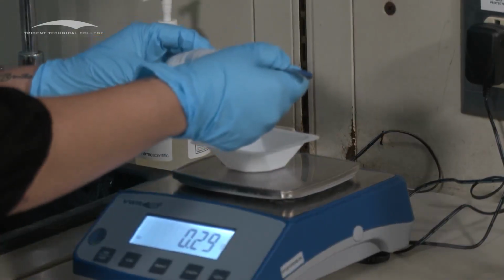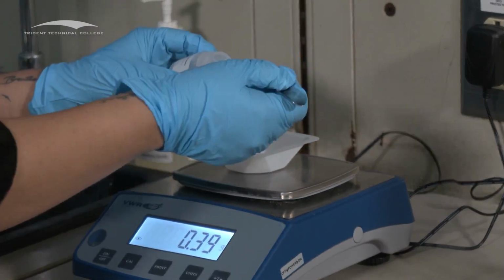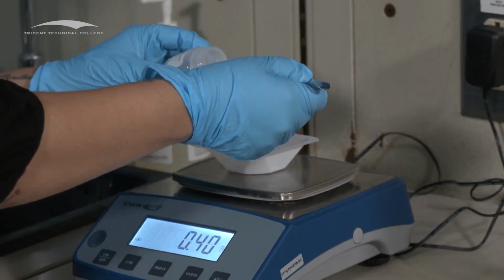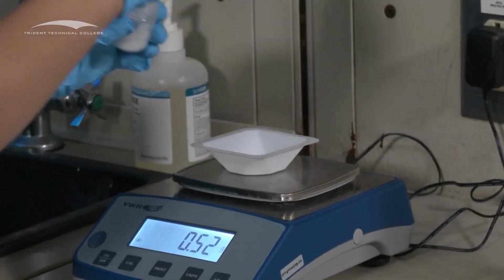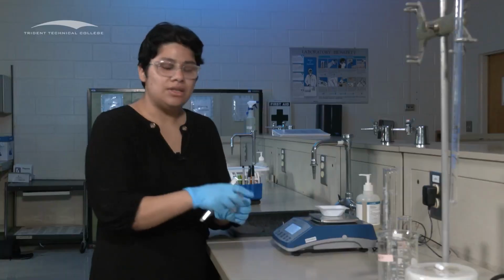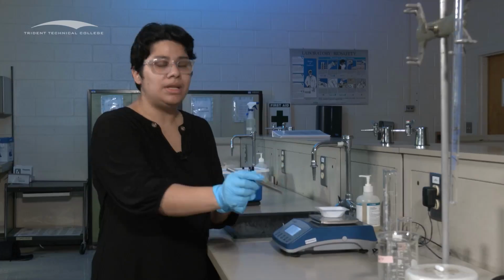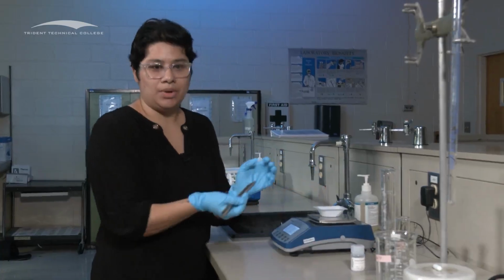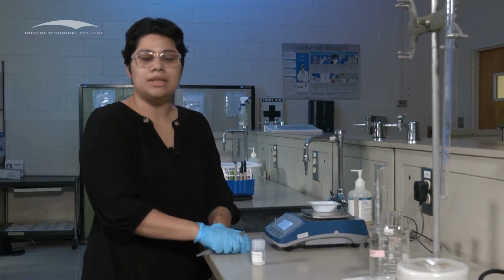So we're gonna go ahead and get our, I'm gonna use 0.5, you may be using a little bit more. And then if you get any extra, oh, look at that. Perfect. Oh, I'm gonna get a little bit more, so that's okay. As long as you recorded, it's fine. Now, if I get like 0.6 and I want a 0.5, then I'm going to find a waste container and put it in the waste container. So let's say I don't want the 0.02, then I will just pour it into my waste container. We never pour back into your solid container because it will contaminate it.